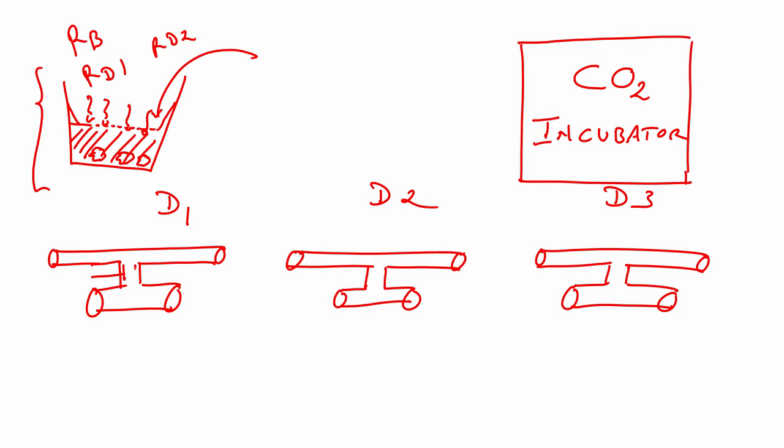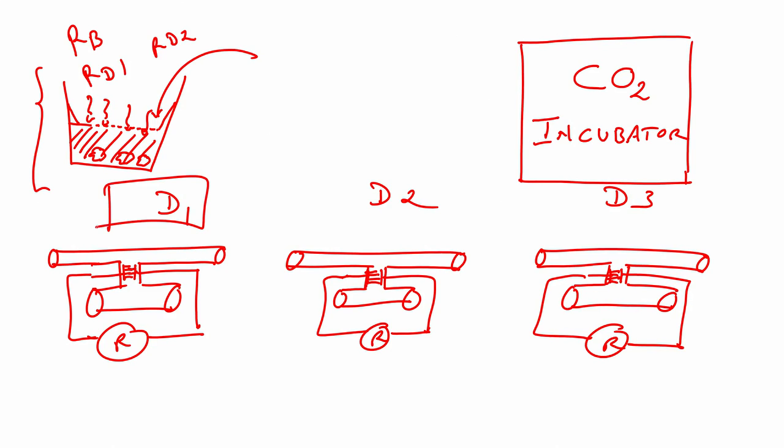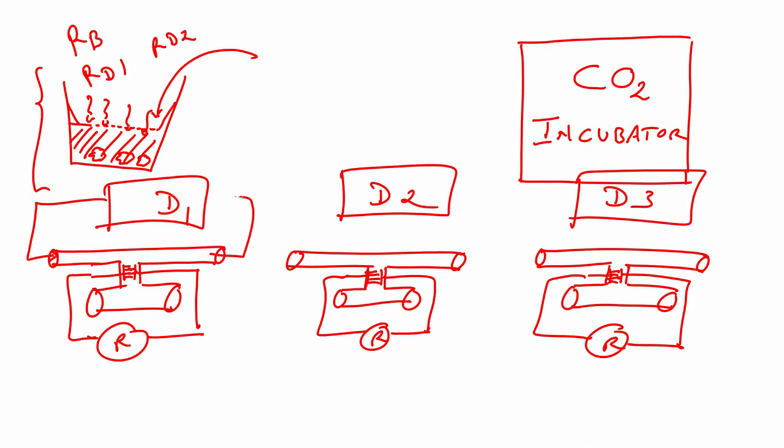And here what we have is inter-digitated electrodes, like this, correct? We have inter-digitated electrodes. Now, drug 1 is loaded into reservoir 1, reservoir 2, reservoir 3, and we are flowing the drug into the microfluidic platform, and the drug will come back to the reservoir. Okay. So, this is my microfluidic platform.